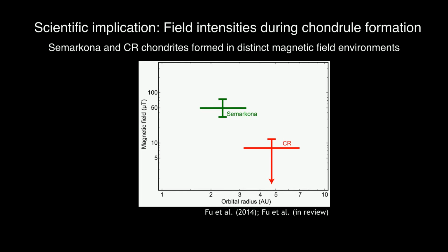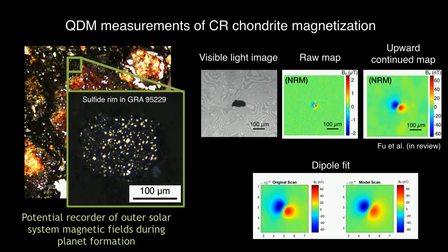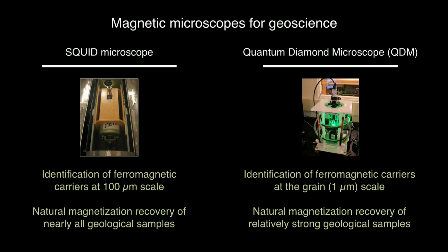You mentioned the detector again. What did you use to determine the magnetic field? For the first data point, it was this one, and the right data point was this one. So that's the QDM. The detector here is a nitrogen vacancy color center doped synthetic diamond. It's a new quantum technology that allows you to optically probe magnetic fields, basically.